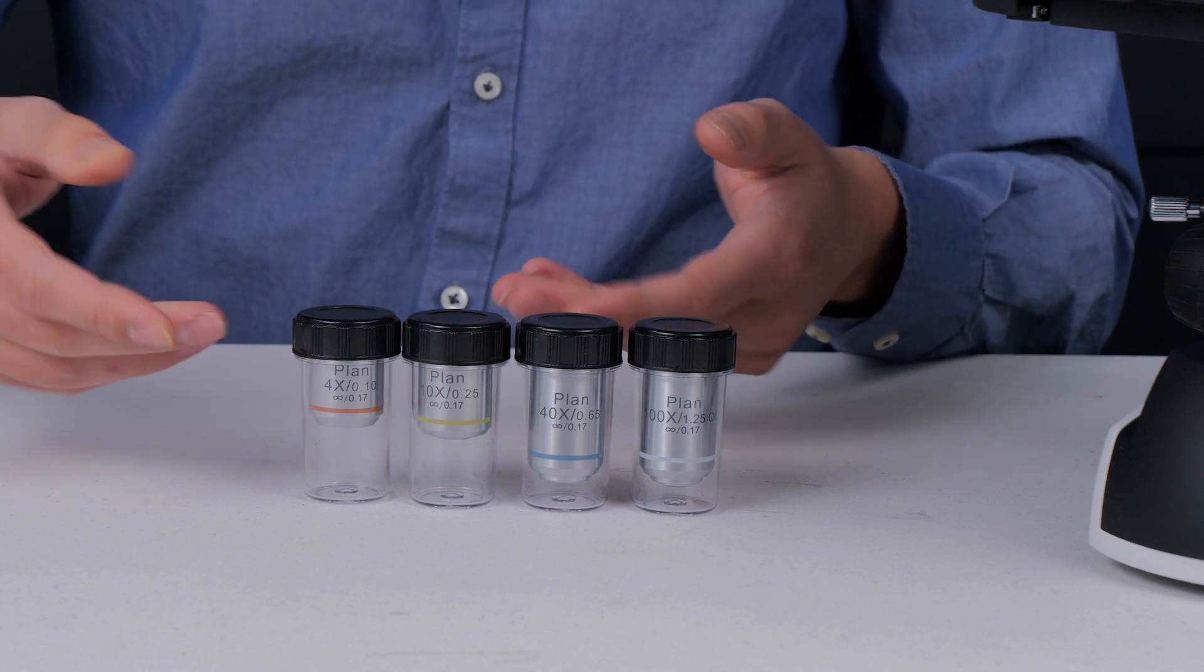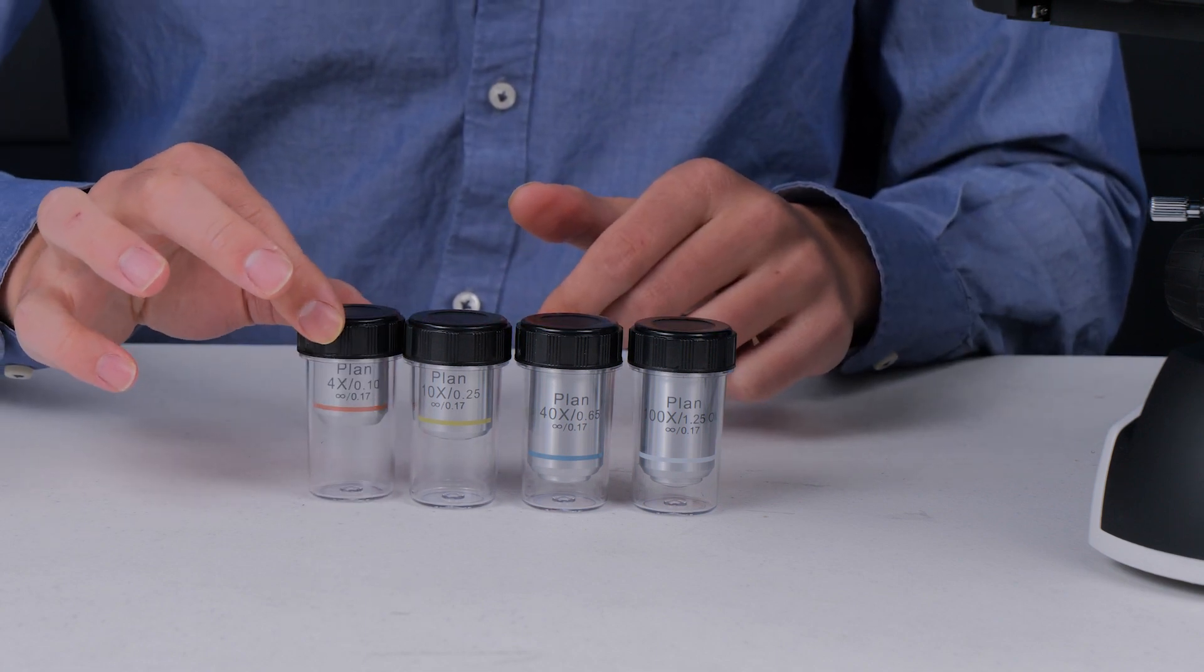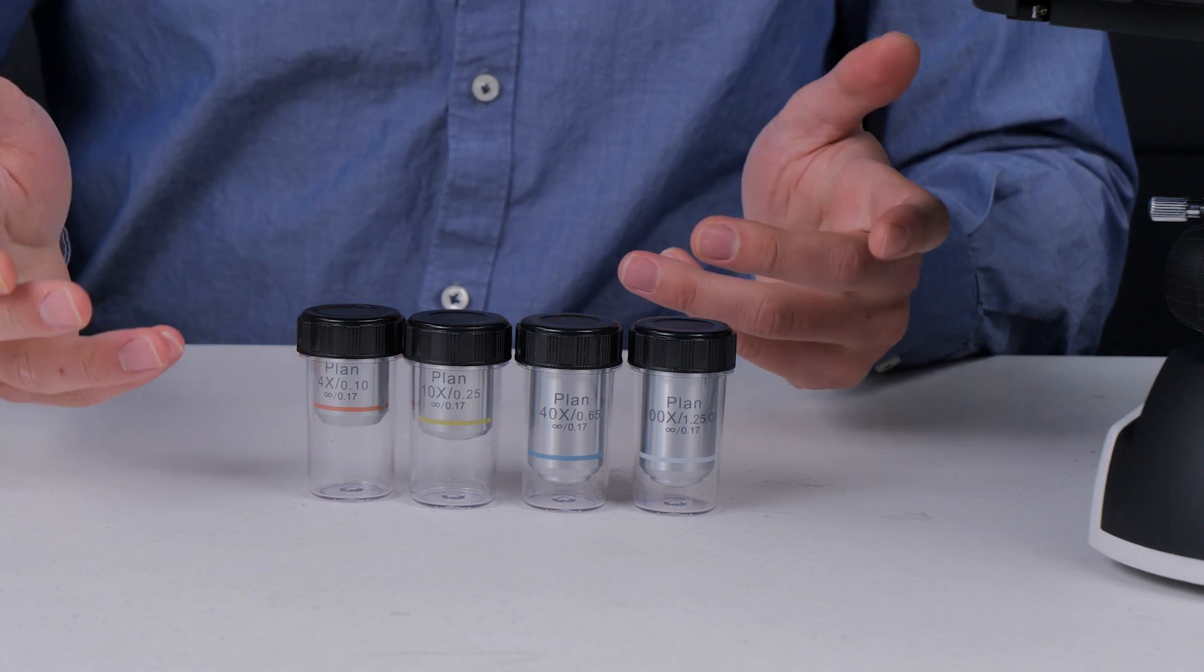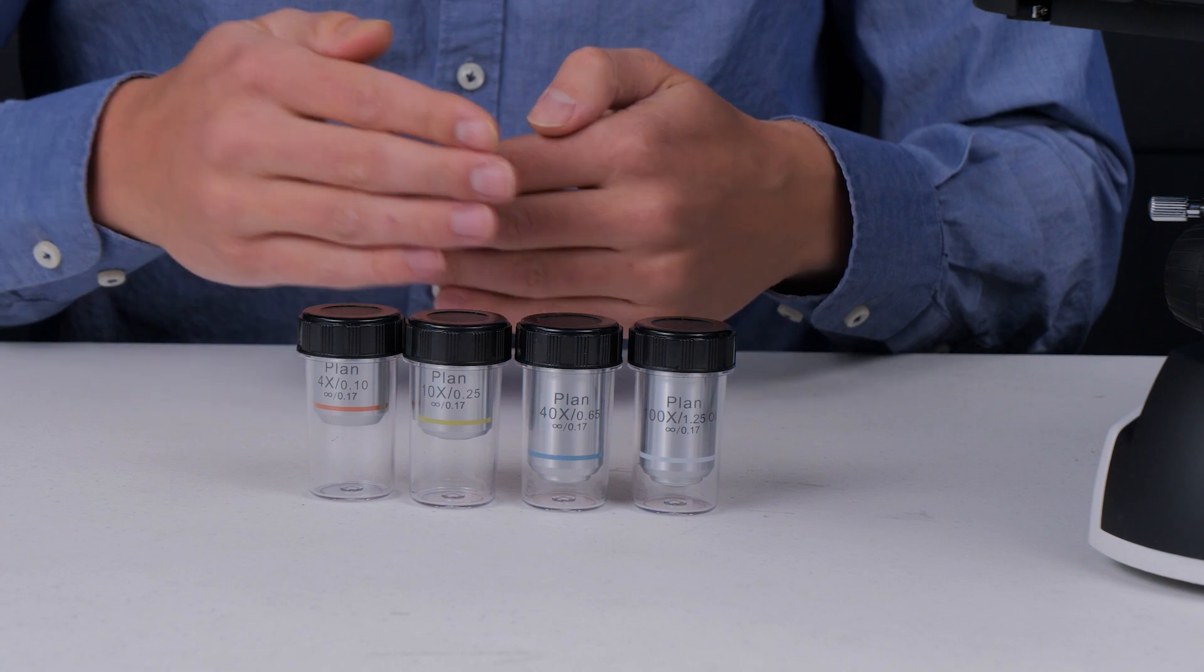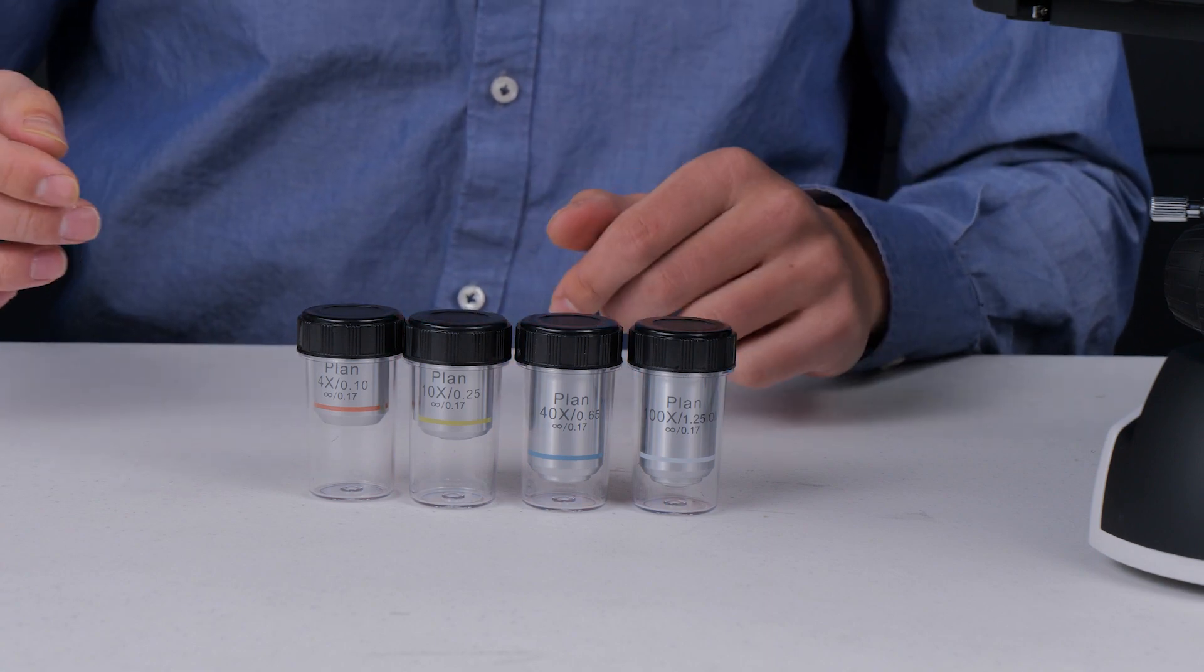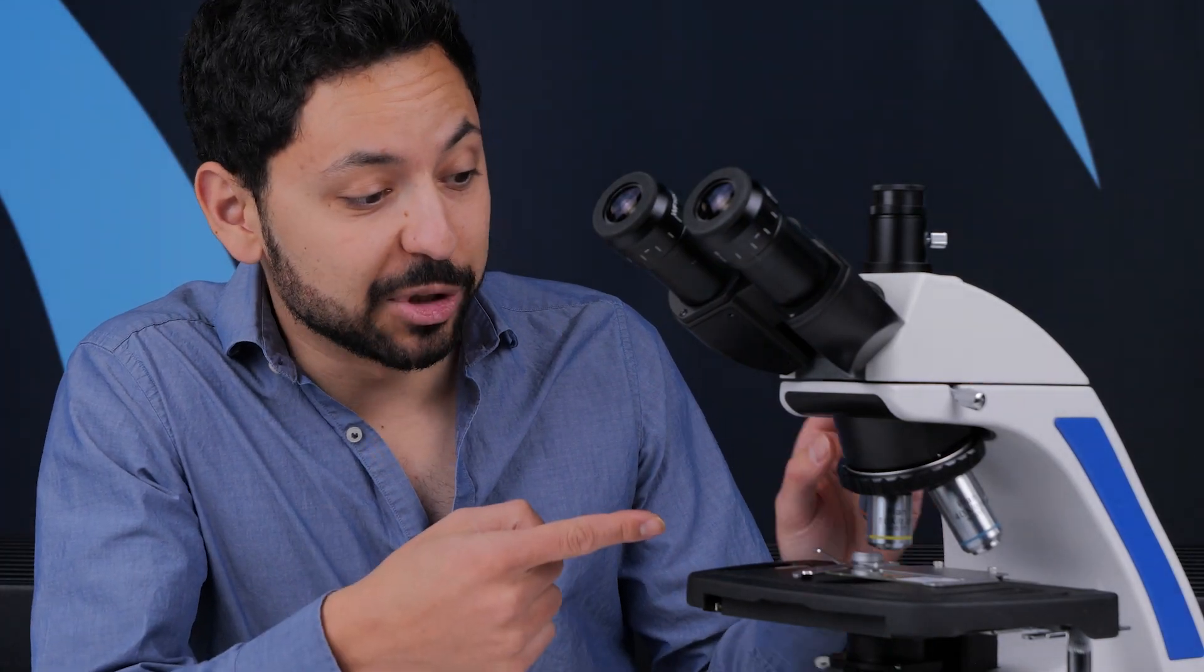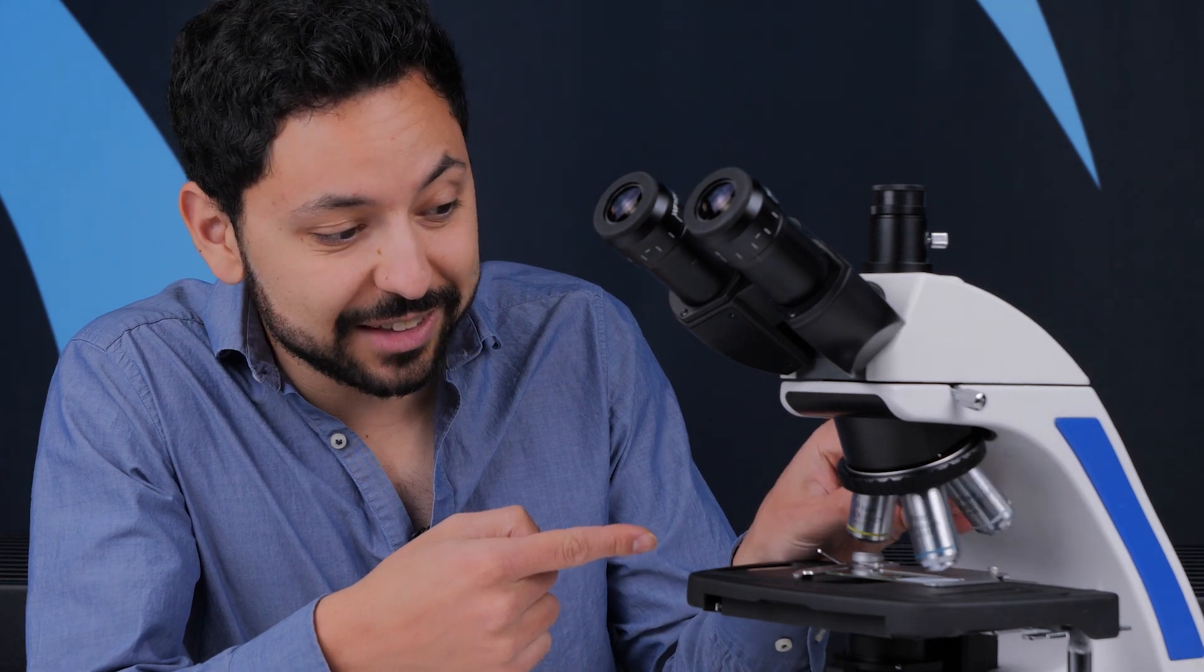Putting a really high numerical aperture on a low magnification objective doesn't really net you any benefits and there are some practical challenges that come up when you scale to these higher numerical apertures. For example, at high numerical apertures the bottom of the microscope objective is basically completely touching the sample and it has to be like this.